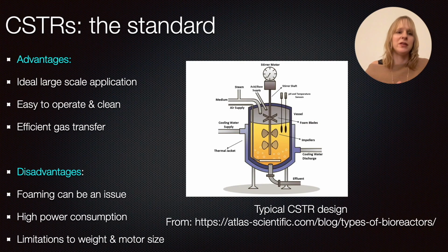Probably the most common is still the continuous stirred tank reactor. Here you can generally see what this setup looks like. Because it's continuous, we always have things coming in and things going out. Then you might have a sparger on the bottom if you work with an aerated system. You would have some impellers that create the movement you need to facilitate the transfer between the gas and the vitamins and everything that you have in your mixture. If this is a bigger reactor, you might have a multi-stage system with multiple impellers to make sure that the mixing is sufficient.